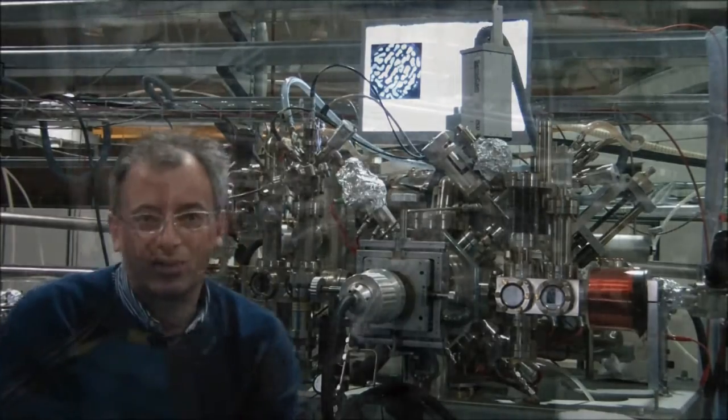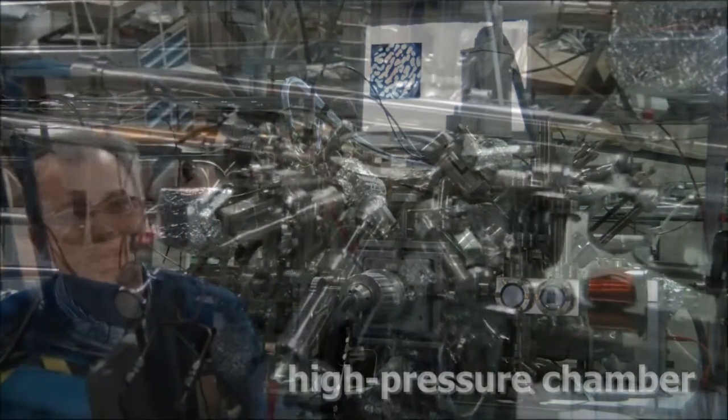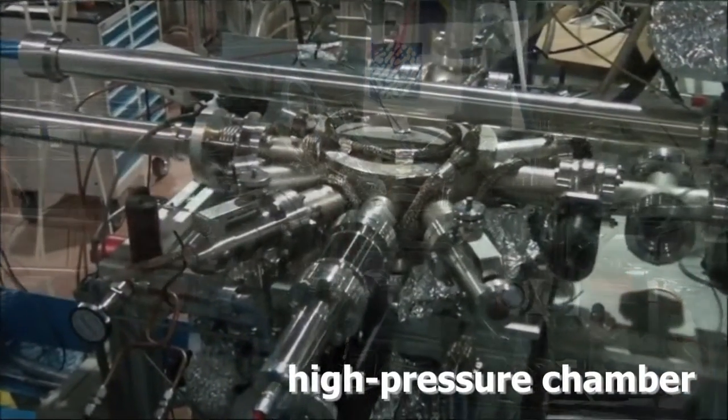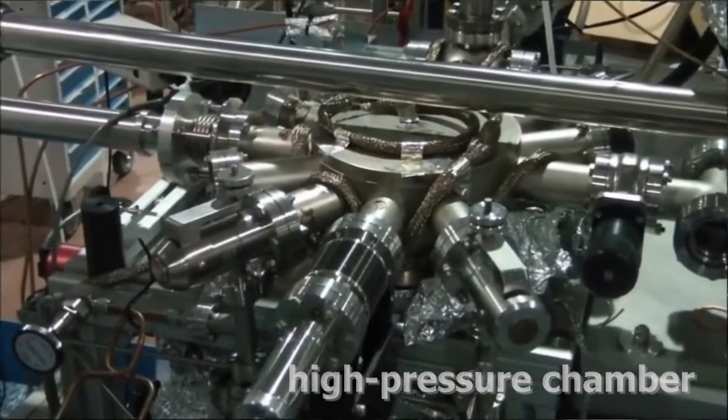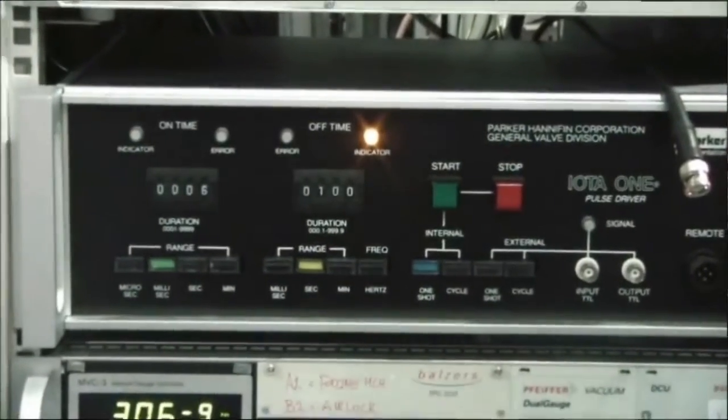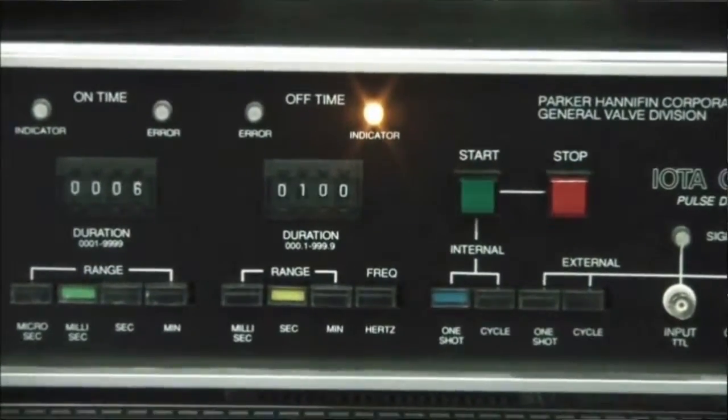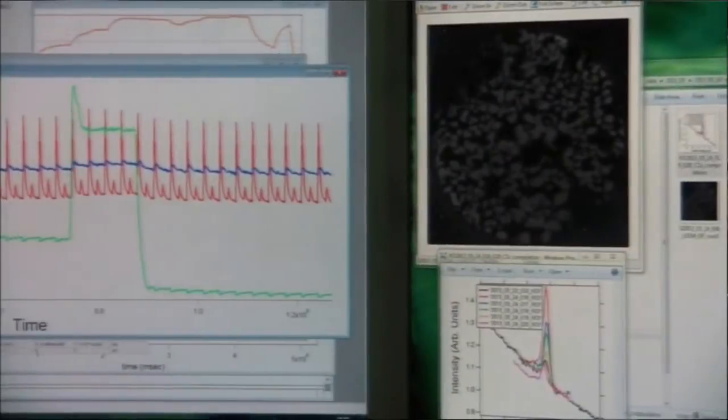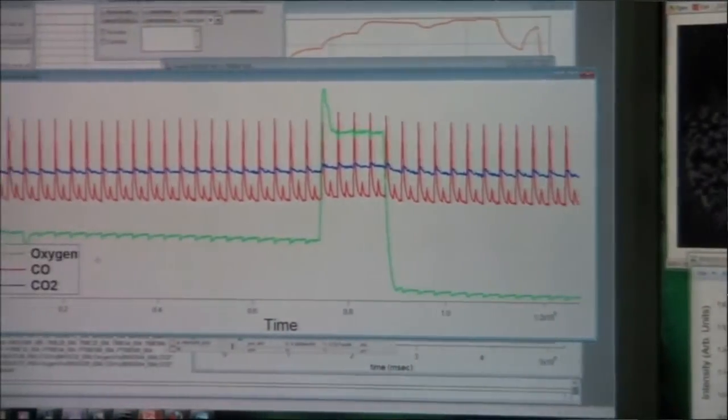The recent addition is a new reaction chamber for catalysis experiments in the millibar range, where we use mass spectrometry to monitor the reaction products under realistic reaction conditions, bridging the well-known pressure gap between ultra-high vacuum and ambient reaction conditions.